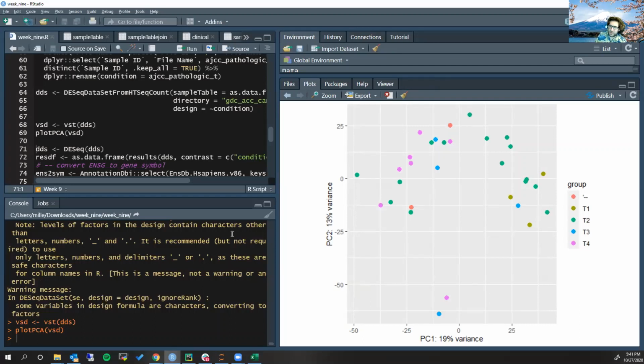Yeah, so one of the things that we could do here, if we really wanted to know, yeah, so Catherine and Simon both said T1 versus T4 is probably a decent comparison. And I would agree with you. In fact, I would say T1 versus T4 is probably the starkest difference I see here. And that's nice, actually, because those are the most extremely different kinds of tumors.